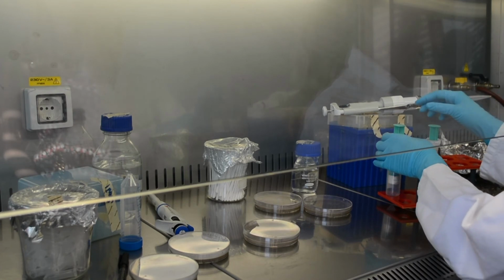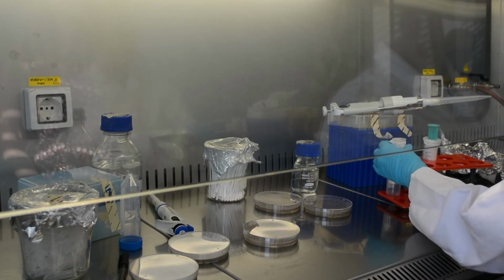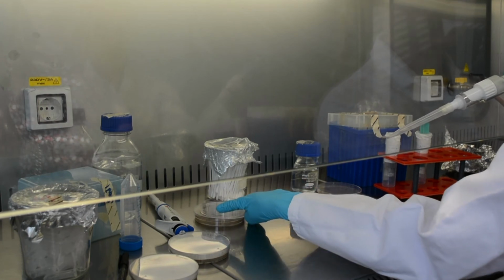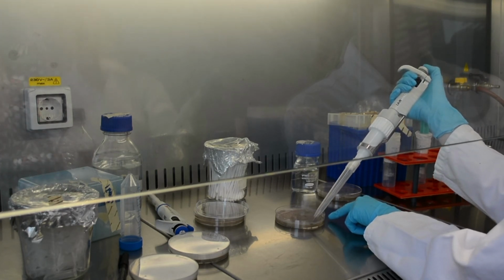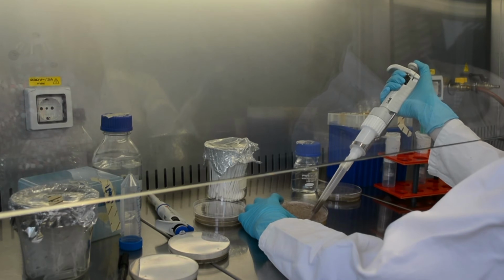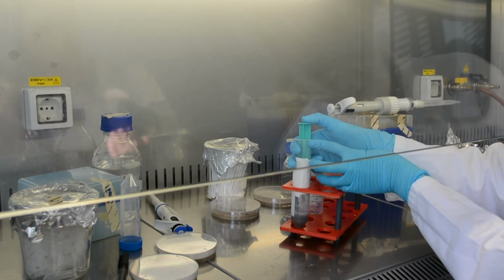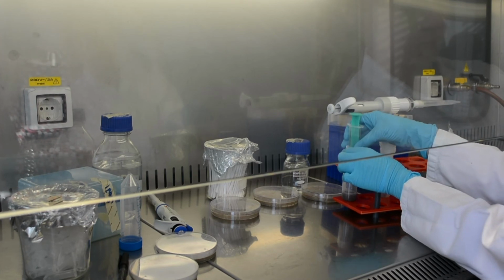Now open the syringe and use the 5 ml pipette to transfer the spores solution into it. You need to apply a little pressure to get the solution out. Bigger parts, for example parts of the agar plates, will be stuck in the absorbent cotton.